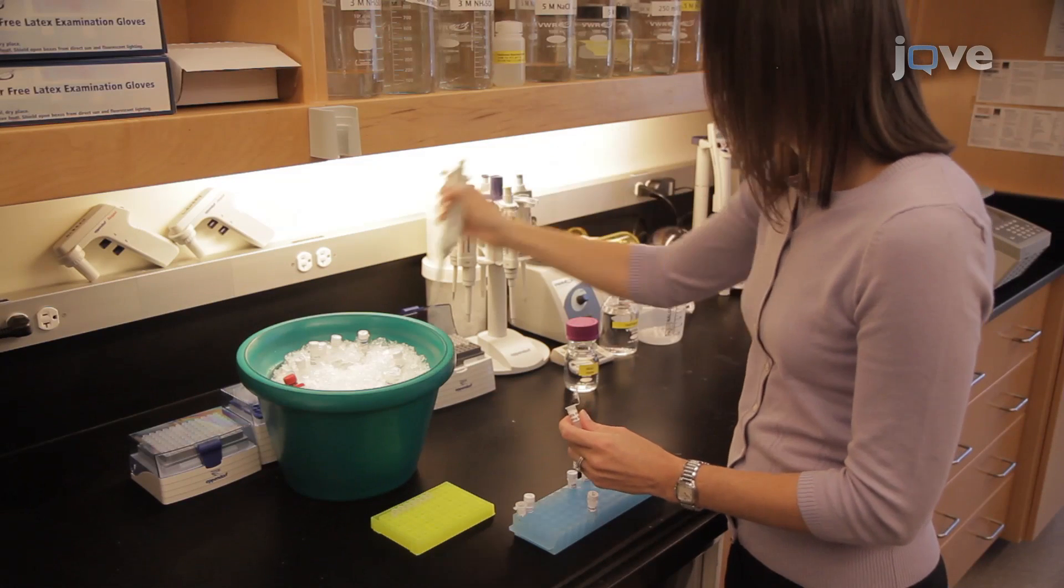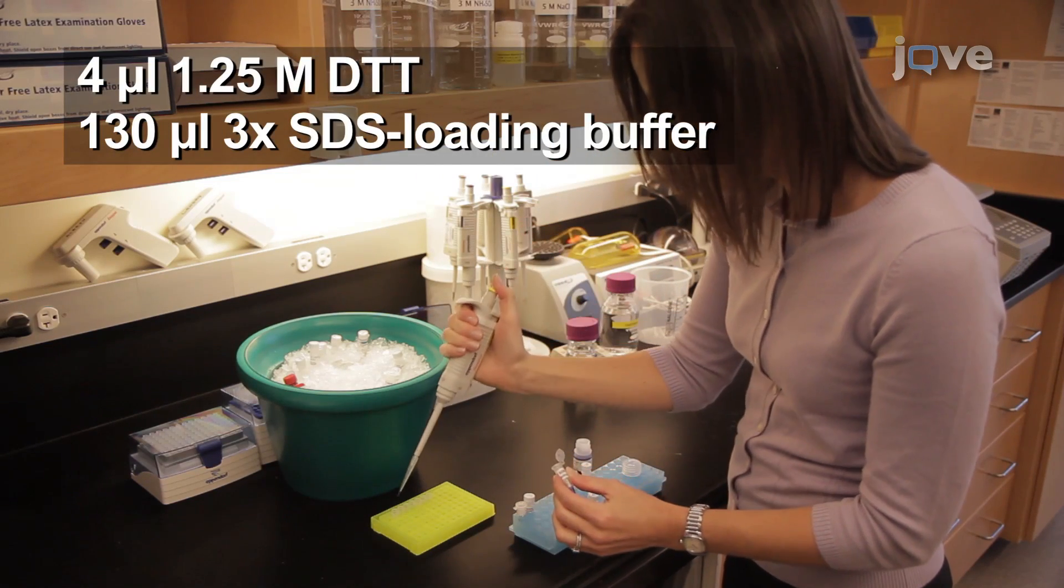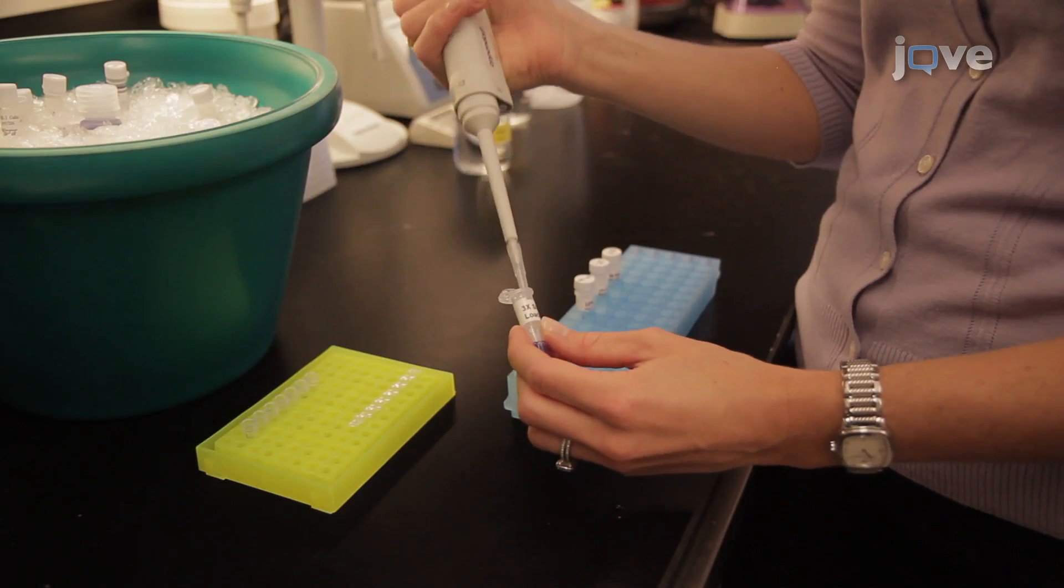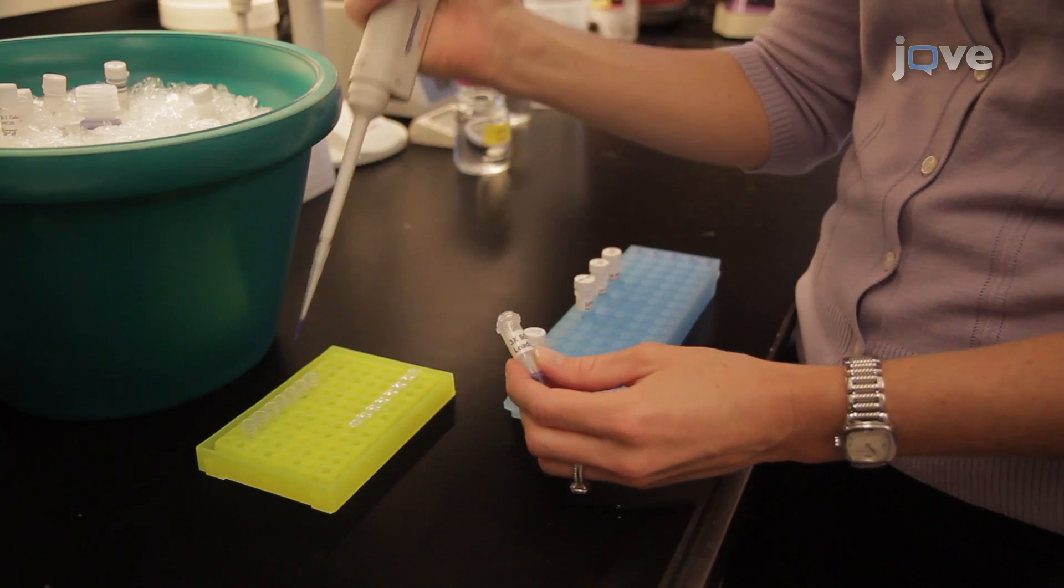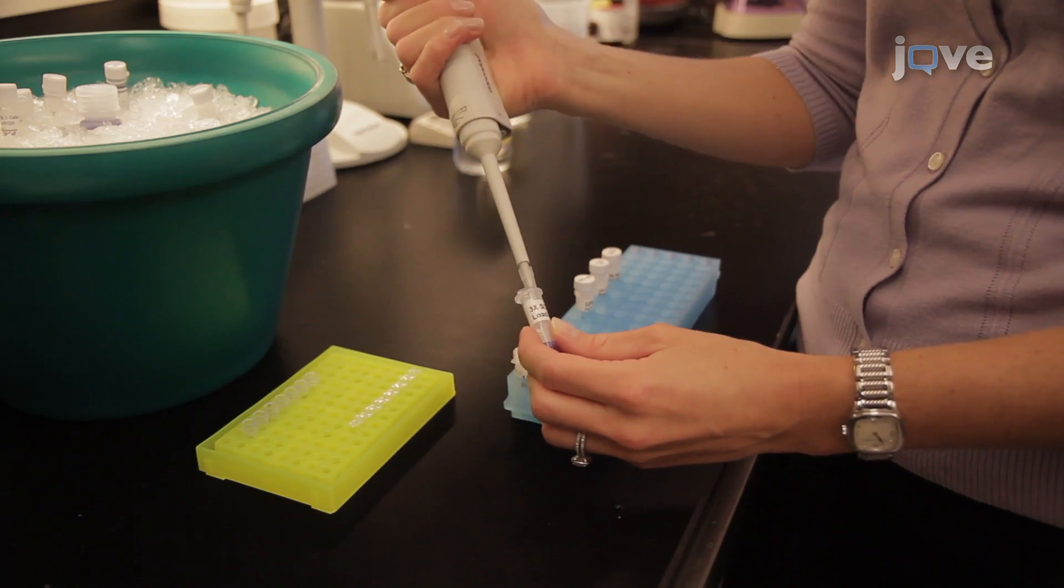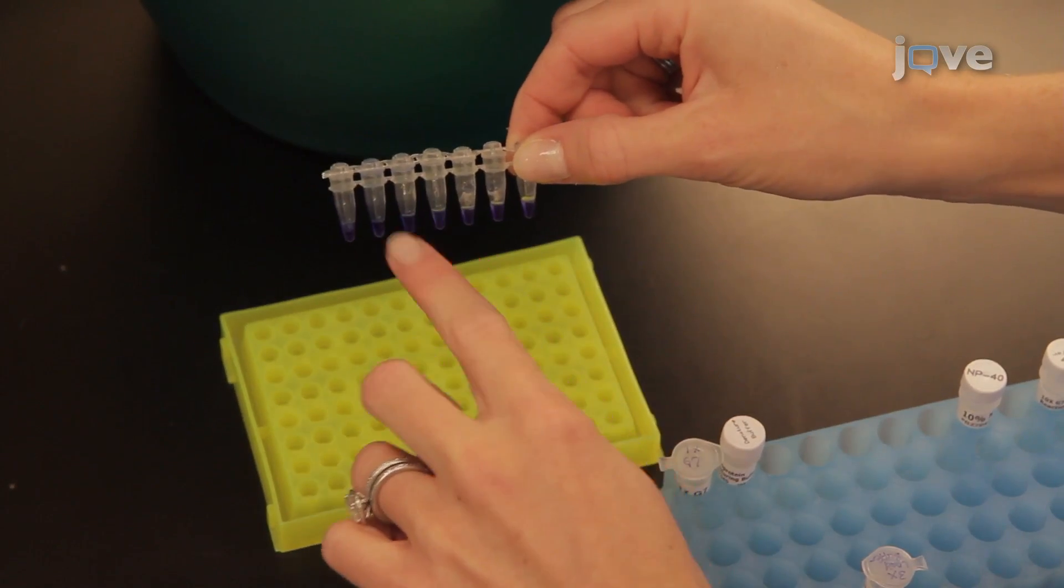To set up SDS-PAGE, prepare fresh 3X reducing SDS loading buffer with DTT. Add 12.5 microliters of the prepared 3X reducing SDS loading buffer to each sample. Close the tubes with new caps and gently tap the tubes to mix.